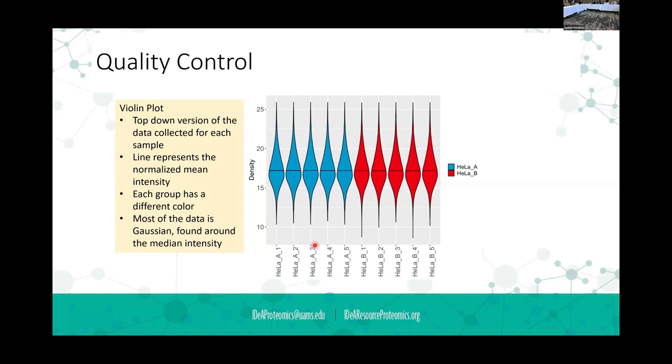that was used. So if, for instance, I could show you if I had a different cell type in here, I didn't have a HeLa cell and something else was growing in there, because sometimes that happens, right? You end up with some sort of bacteria or contamination that grows in there, and you do a BCA, and bacteria has protein in it, so you think you've got lots of protein in there, and then when you do your analysis, it looks completely different because those aren't cells anymore. It's bacteria. Or a cell lysate versus a serum sample.